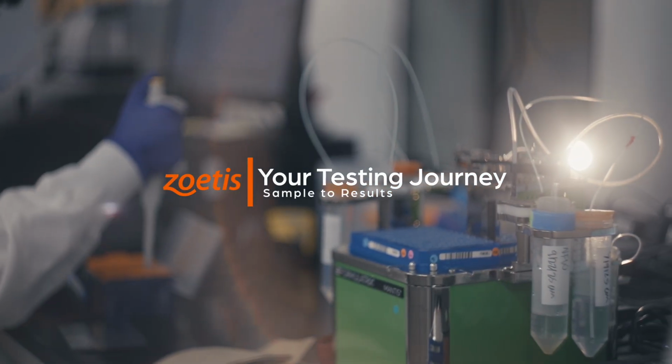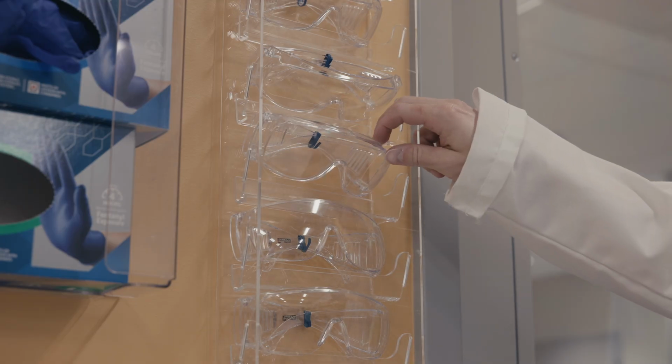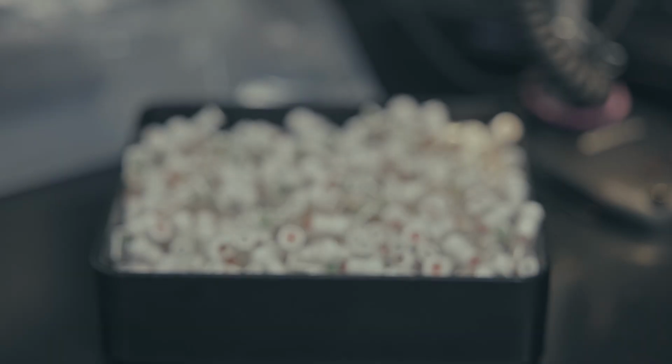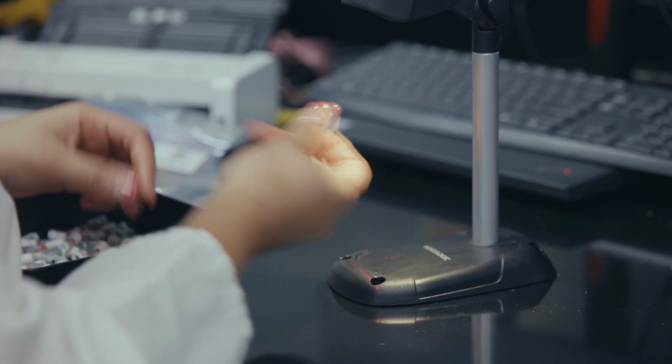So the life cycle of a sample: once the customer puts the samples in the mail, it's going to be received at our facility, and then it's going to go through essentially an inventory. We're going to log that sample into our system so we know that we've received it, and then we're also going to connect it with the animal information that you've sent. So it's very important for us to understand, we got this tissue sample, who is the animal inside of that tissue sample, right? The sample is only as valuable as understanding the animal inside of it.